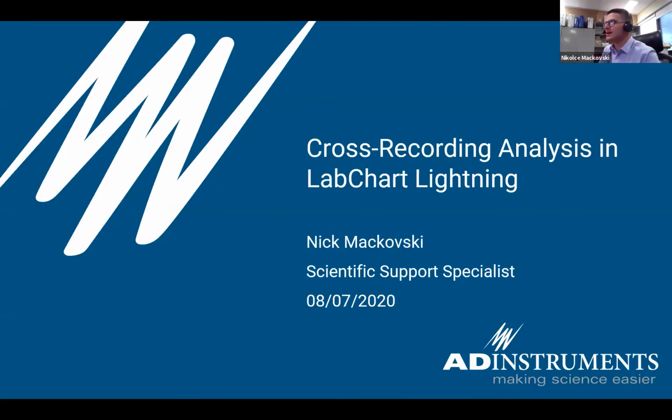Today we're going to go through a really exciting new feature within Lightning called Cross-Recording Analysis, specifically to do with the table. It's a really easy and efficient way to collect the data you analyze within your recordings, or within your LabChart files, into one simple data table. So you don't have to worry about always copying something and pasting it over to Excel, as an example, or Google Sheets. This way, it's a really simple way to put your data together and do some extra calculations to really maximize what you can get out of your analysis. So let's go through that together.